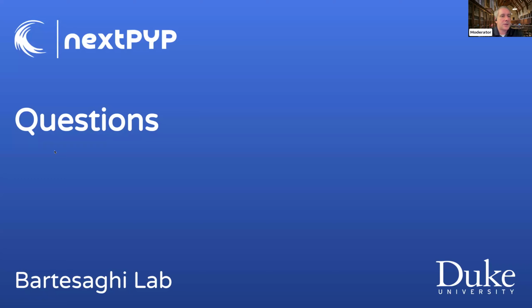Let's see. So the next one is what CTF methods does the preprocessing support? For CTF, we typically use CTFFIND4 with a little bit of our own flavors on it. But that's our default, and I believe we support CTFPLOTTER now, question mark? No, I think it's still CTFFIND. It's based on CTFFIND4. CTFFIND4, okay. Yeah.